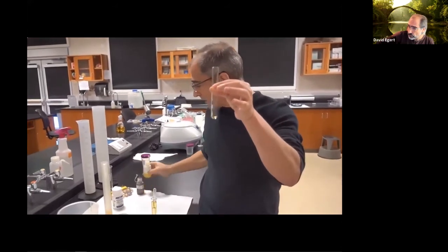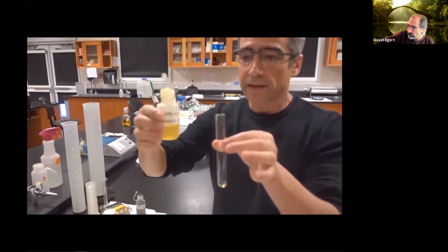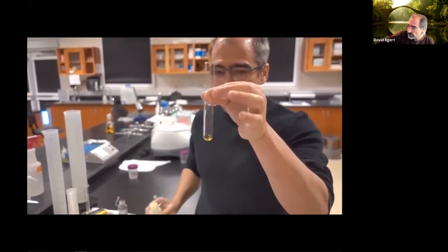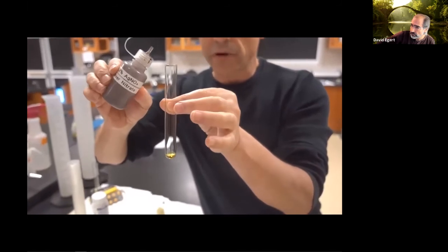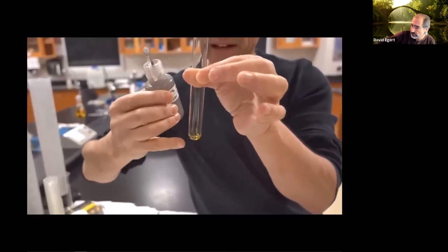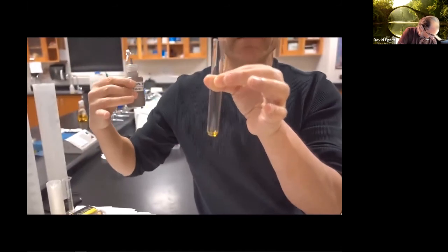Then I'm going to add exactly 1 drop of this potassium chromate solution. And now I'm going to add silver nitrate solution drop by drop by drop. And this forms a precipitate. And you'll see as a drop hits the solution, it's going to turn brown for a moment, but then will probably become yellow again.